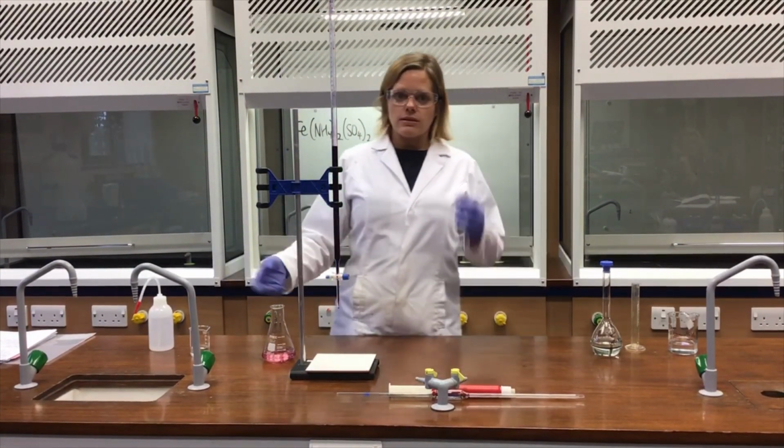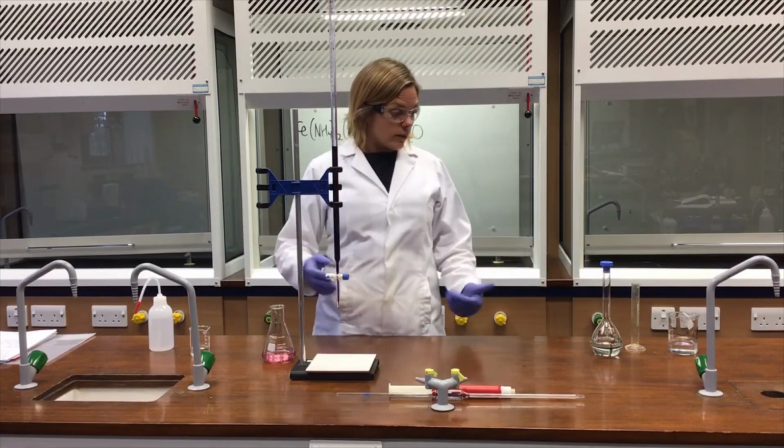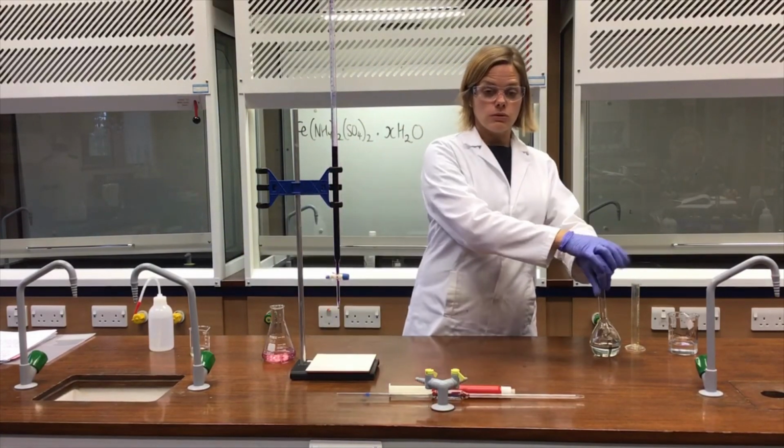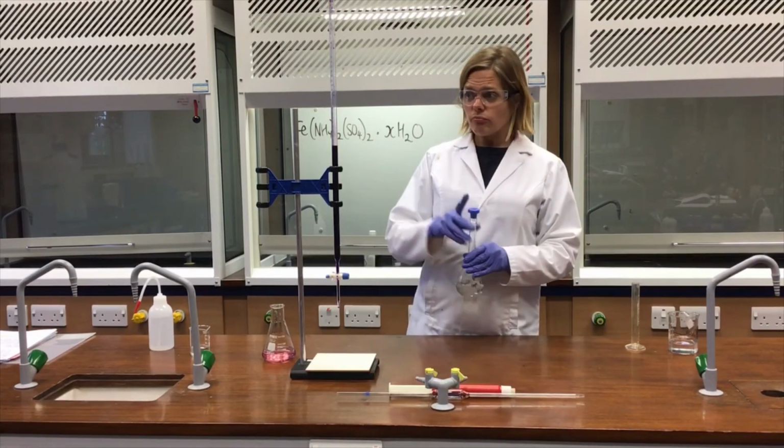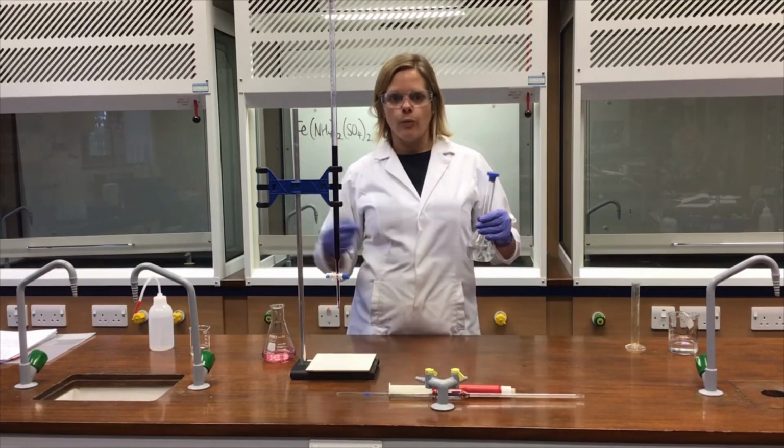So empty that out, rinse the flask, refill with another aliquot of the 25.0 centimetres cubed of the Fe2+ solution, achieve concordancy, and then work backwards through that.